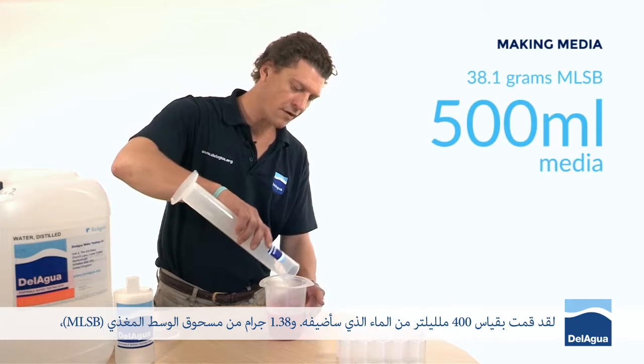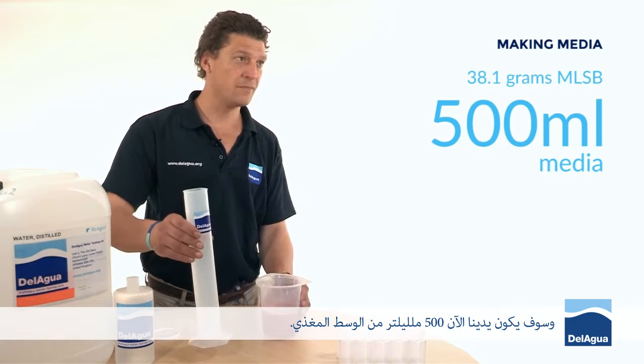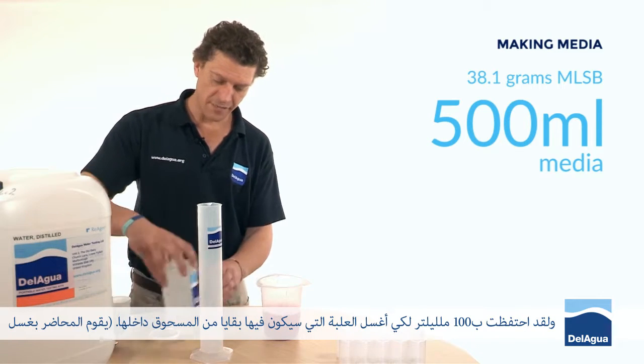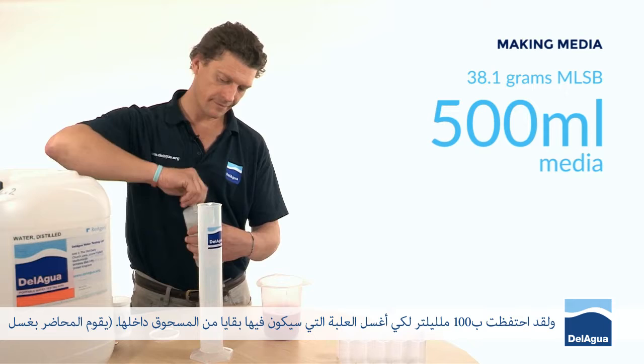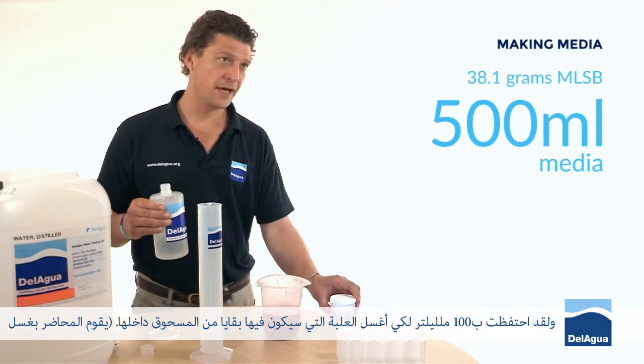38.1 grams of membrane lauryl sulphate powder makes 500 millilitres of media. I've saved 100 millilitres in order to be able to rinse out the container, which will still have some powder in it.